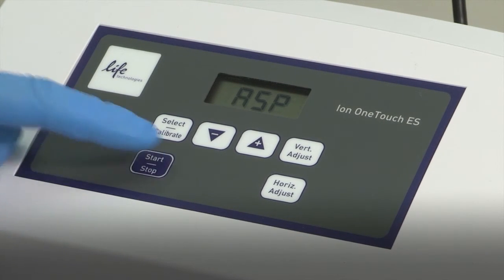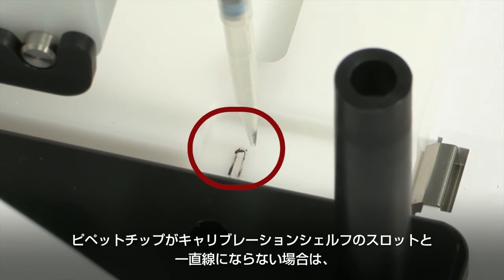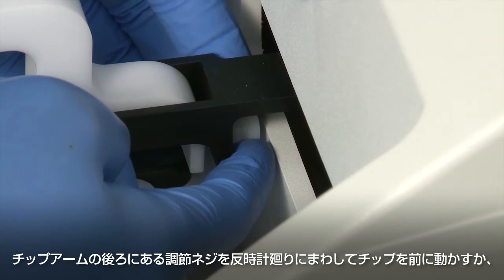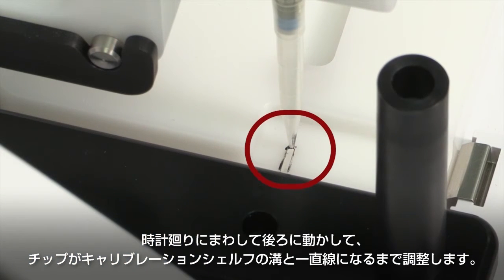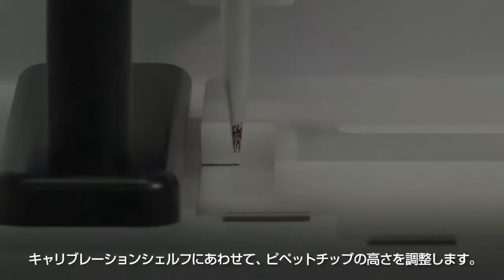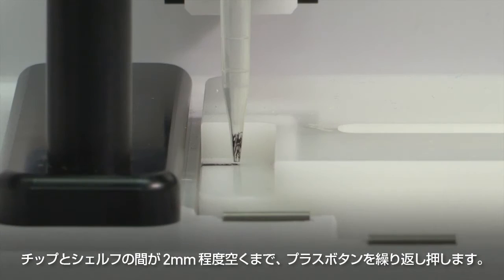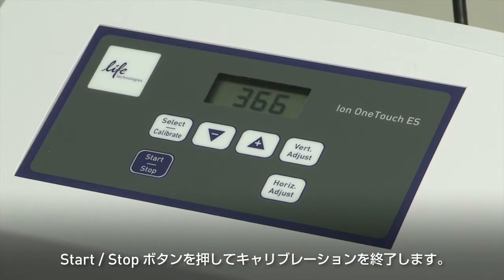Press Start-Stop. The tip arm lowers to bring the tip near the notch in the calibration shelf on the left side of the tray. If the pipette tip is not positioned in line with the slot in the calibration shelf, adjust the thumb screw at the back of the tip arm — counterclockwise to move the tip forward, or clockwise to move the tip back — until the tip is in line with the notch in the calibration shelf. Adjust the height of the pipette tip in relation to the calibration shelf. If the tip is already touching the shelf, raise the tip until it is no longer touching the shelf. Press the plus button repeatedly until the tip clears the shelf by two millimeters. Exit the calibration using the Start-Stop button.